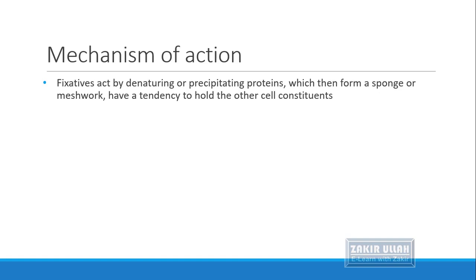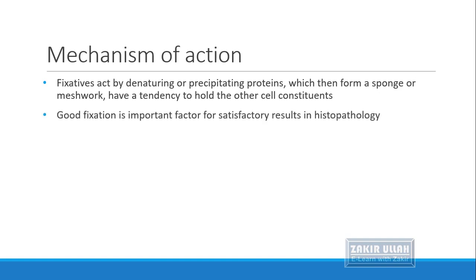These denatured or precipitated proteins form a sponge-like meshwork, and within this meshwork, all the components present in between these proteins are held in their original condition. So the tissue is held in the original condition or near to the original condition. And one of the important properties is that good fixation is important for a good histopathological result and good staining.